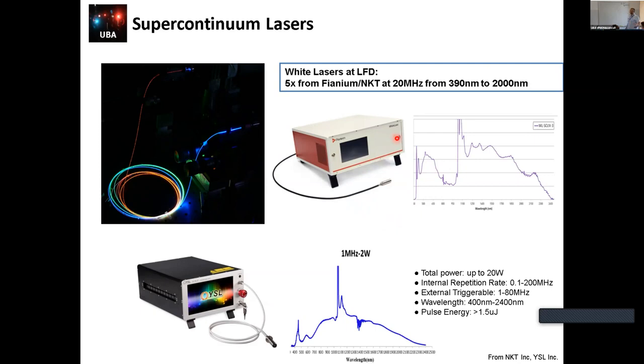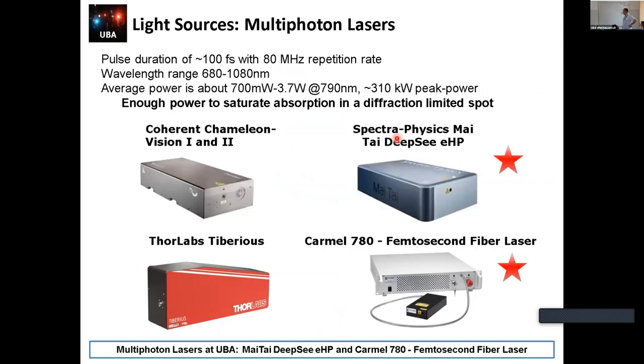But also you can co-excite many. And I know that Lorenzo Scipioni is going to talk about a particular microscope that he developed for spectral and lifetime FLIM, spectral and FLIM. And he's using one of these supercontinuum lasers, and he has all the wavelengths, and he can do everything he wants. He is also considering using the laser for STED. The laser that he got is really, really powerful, so he can deplete the excited state and send molecules down to the dark state.